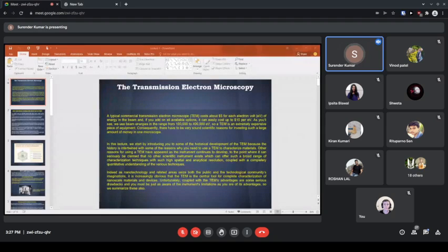But the resolution is very important. Suppose someone asks what a microscope is: we say it magnifies small images into big images, which we cannot see with the naked eye.